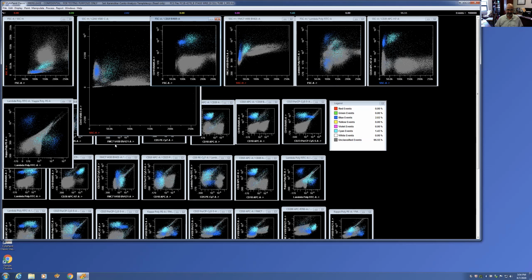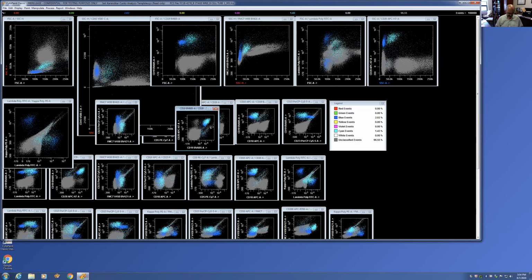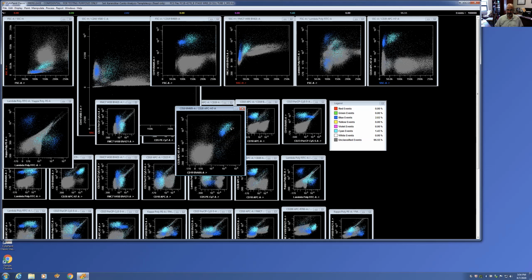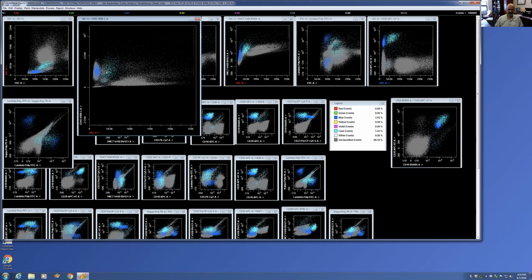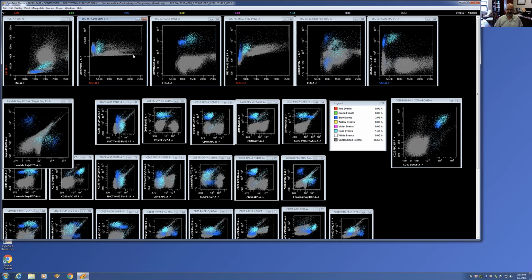These are B cells. These are 19 positive. Here, where are they? These are 19 and CD20 positive, right? Nice and bright for 19 and 20 right here. So you would not have even considered this population in the beginning. Maybe you would have gated it as a monocyte gate and then found it, which actually turns out to be a big clue in this case.